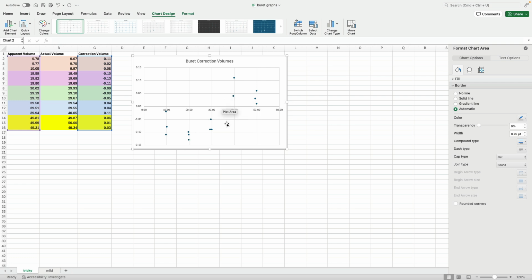We can try it and see. And this is the part where you're going to have to maybe play around with this a lot. So what I'm going to do, I think this is going down. I think these are all going up, and then I think these are going down. So I'm going to see if I can make all of these one graph, and if that looks okay, I'm going to make these separate plots.